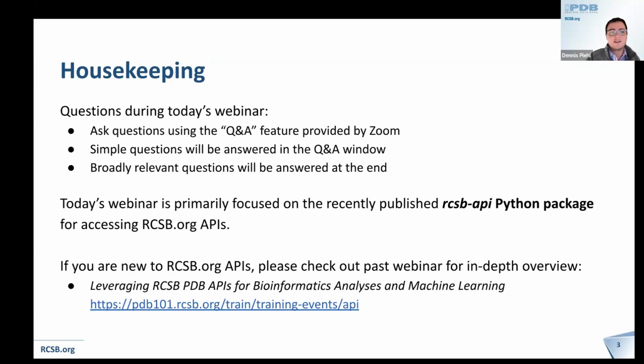Just to emphasize, today's webinar is primarily focused on the recently published RCSB API Python package for accessing rcsb.org APIs. So while I will try to give a brief overview of our APIs, if you are new to them, we encourage you to please check out our previous webinar for a more in-depth overview. And that webinar can be found at this URL here.